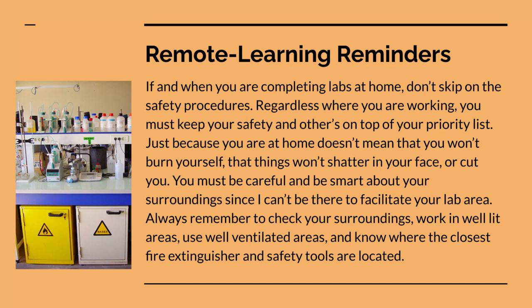And then this last big reminder: if you are completing labs at home, do not skip safety procedures. Regardless of where you're working, you must keep your safety and others' safety on top of your priority list. Just because you're at home does not mean that you can't burn yourself, or that things won't shatter in your face or cut you. They're probably going to happen more often at home. So please, you must be careful and be smart about your surroundings, since I can't be there to facilitate your lab area.